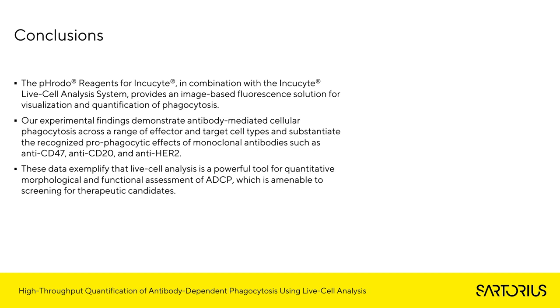Taken together, these data exemplify that live cell analysis is a powerful tool for quantitative, morphological, and functional assessment of ADCP, which is amenable to screening for therapeutic candidates.